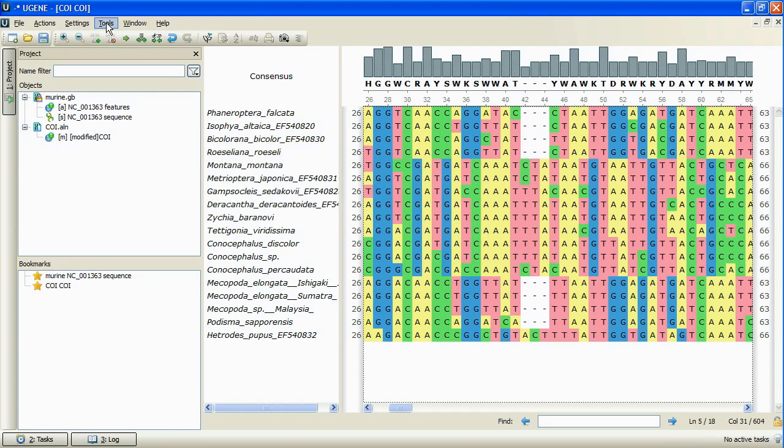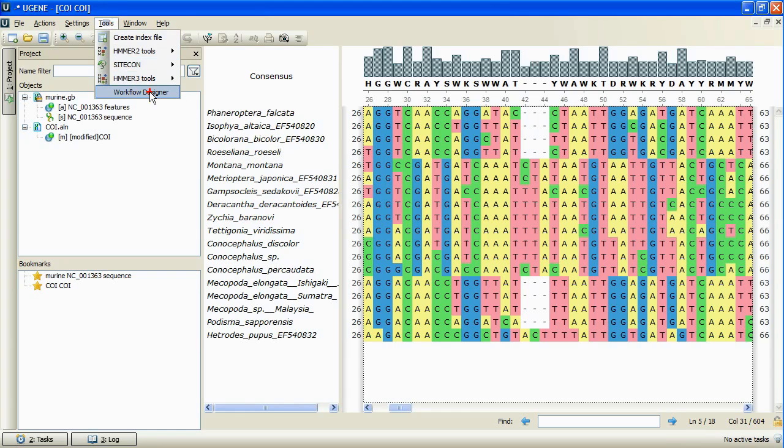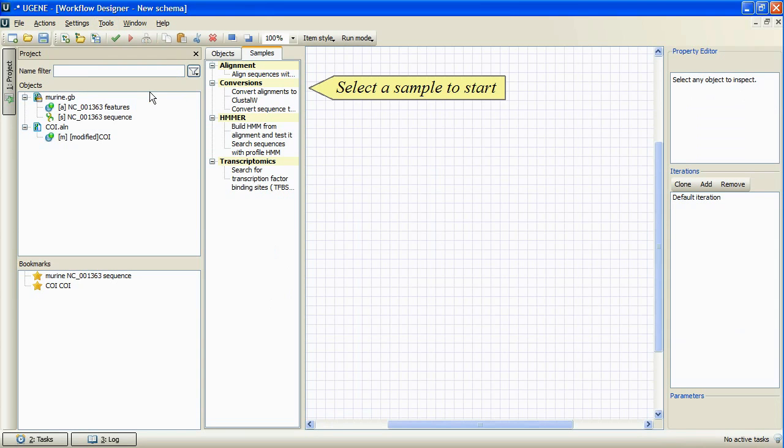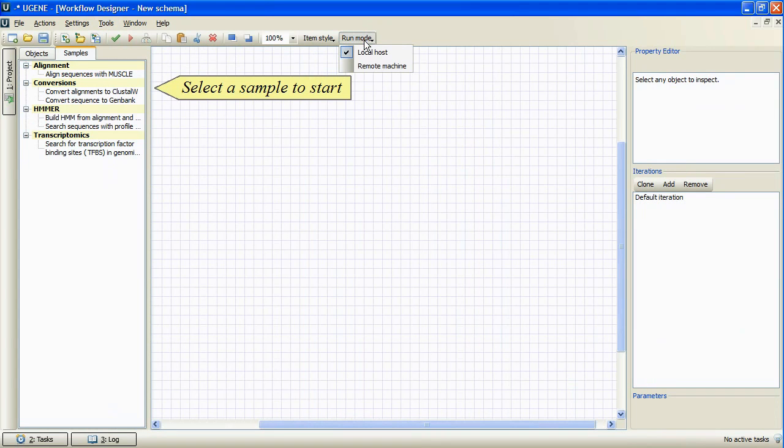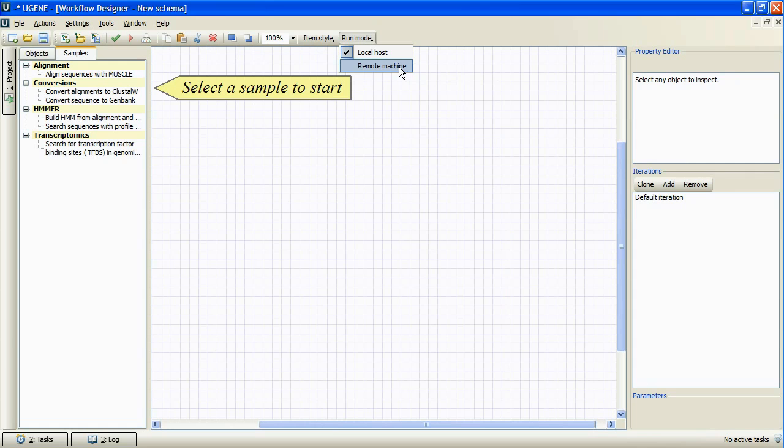Let's open the workflow designer. We can see the new run mode pull-down. Selecting localhost pull-down item leads to working with the designer locally, as it always has been. So, we select the remote machine menu item.